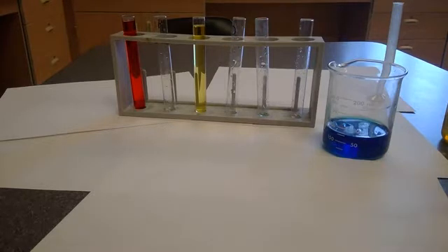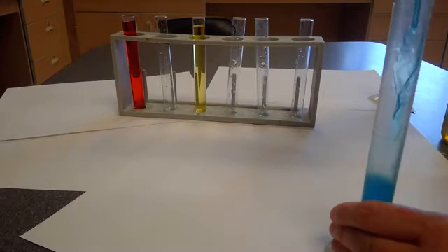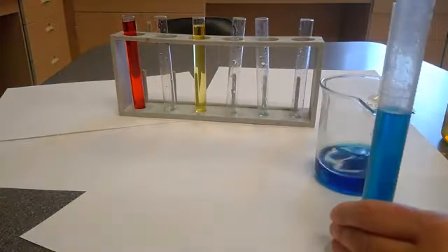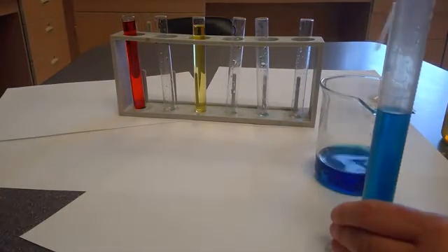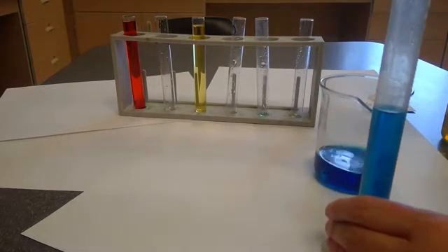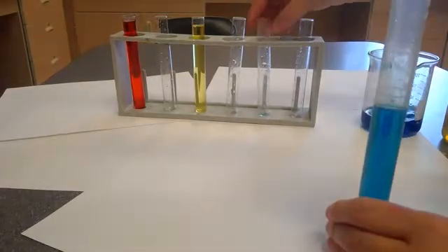Next, I'm going to move on to step 5. Step 5 says in test tube E, I'm going to place 18 milliliters of blue water. So there's 15, 16, 17, 18. I just need to bring up that meniscus line just a tiny bit. And that goes into E.